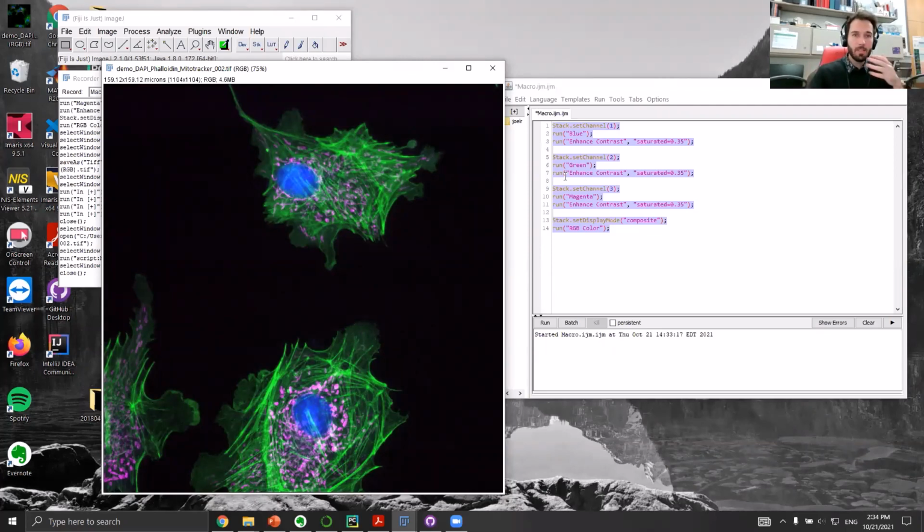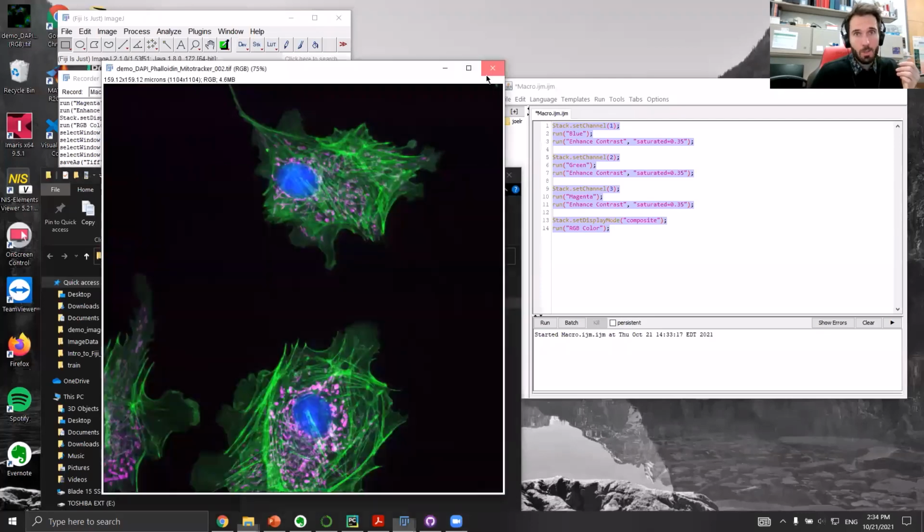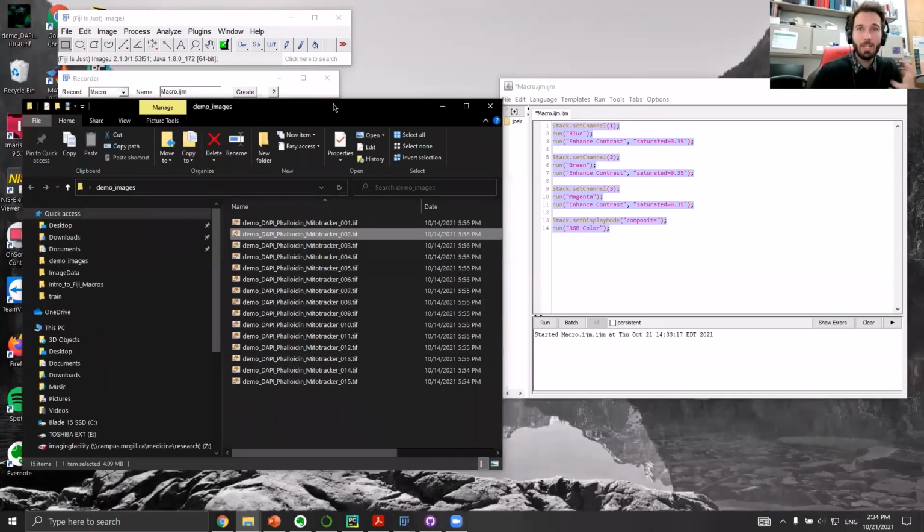And I guess the last thing to do is that, well, we have this folder of 15 images. It would be kind of annoying to open each image, do this, and then save. So we can also speed up that process a little bit. The main way to do this is called batch processing: apply a function to a batch of files. There are 2 kind of ways to do this in ImageJ. I'll show you one way now and another way in the following exercises.